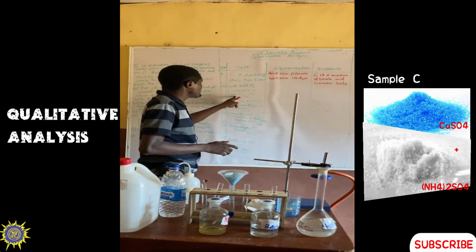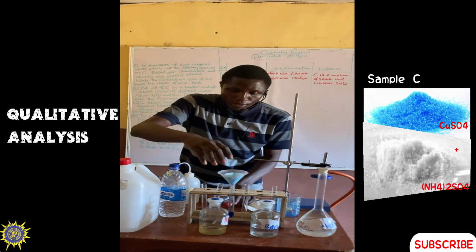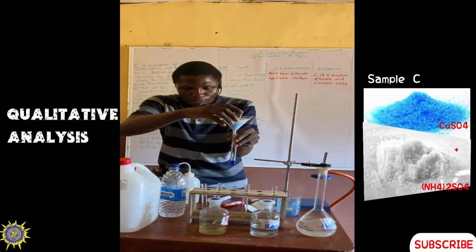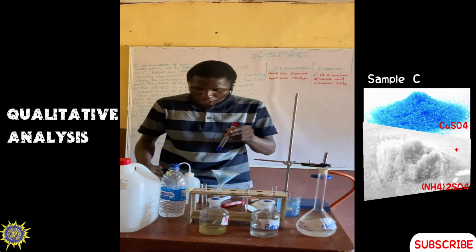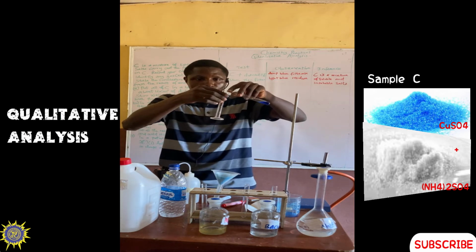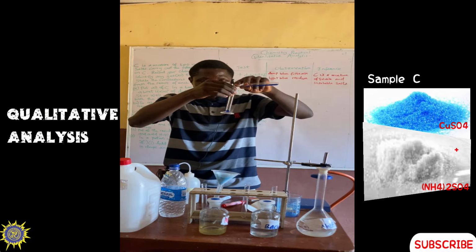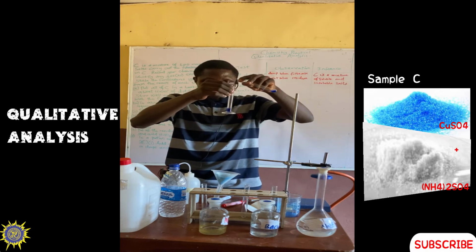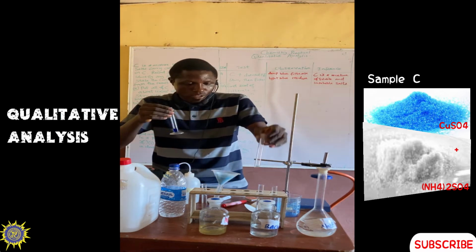add sodium hydroxide, in drops then in excess. We have not yet completed filtration, but here we have enough for 2 centimeter cube for us to measure. So I will have to transfer this to the other test tube. Now let me measure 2 centimeter cube of the filtrate. So let me put it inside another test tube.